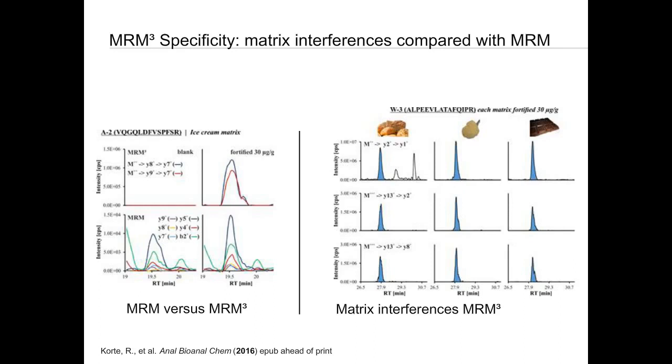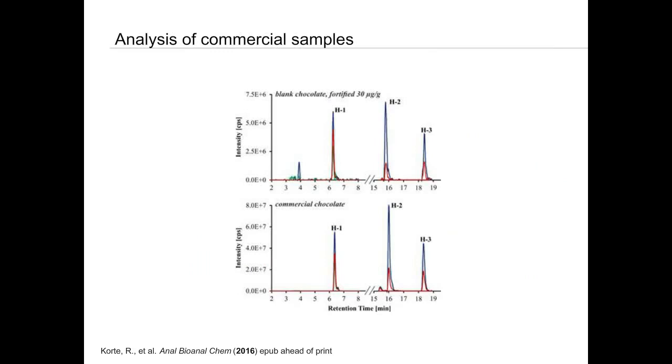Not very surprisingly, the food matrix as well as processing and sample preparation can affect absolute quantification. We have started with a first study on our hazelnut and other nut allergen markers. And we observed that there are different aspects which need to be taken into account. One is, again, extraction of the proteins and digest of the allergens, which can be affected by the food matrix. And further on, the released marker peptides can also be influenced by the food matrix. And the latter point can nicely be controlled by use of stable isotopically labeled peptides, which are in principle available. They can be synthesized commercially and in principle can be used.